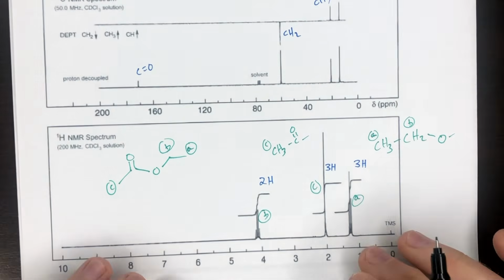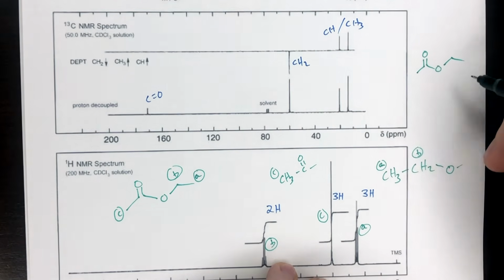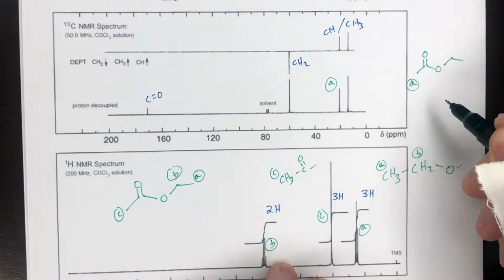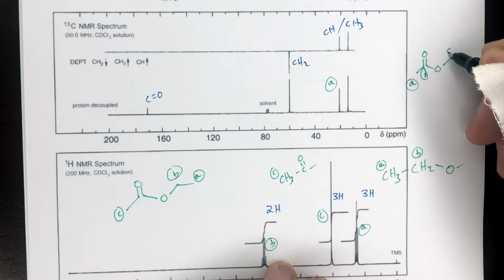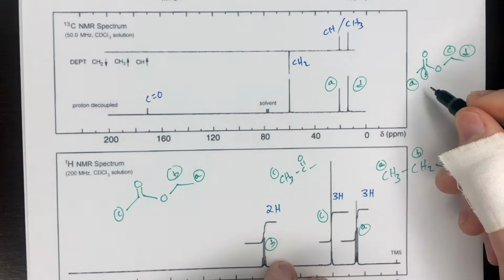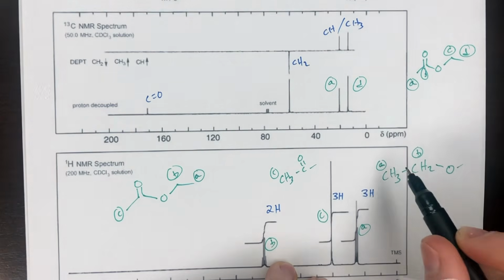And then the same type of information you should provide for the carbon C-13 NMR. So this is A, which would appear about here. Here, let me label all these first. So we have two CH3 groups, A and D. A is going to be more deshielded than D simply because A is bound to the carbonyl, whereas D is bound to just a CH2. So that's why I get this distinction.